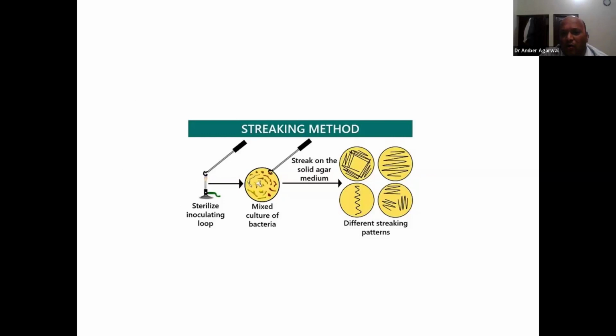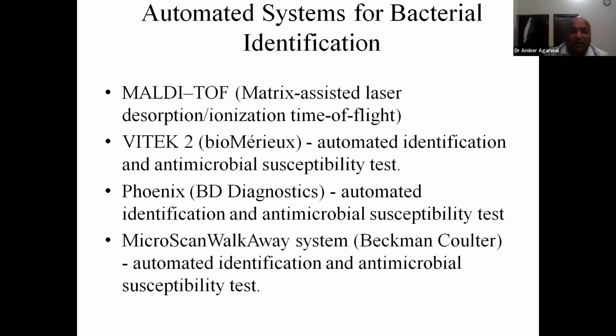Now, this is how the streaking method is done. There are various streaking methods. Again, according to the sample, you have to streak differently. It is not that every sample has to be streaked like this. Now, I was talking about identification.